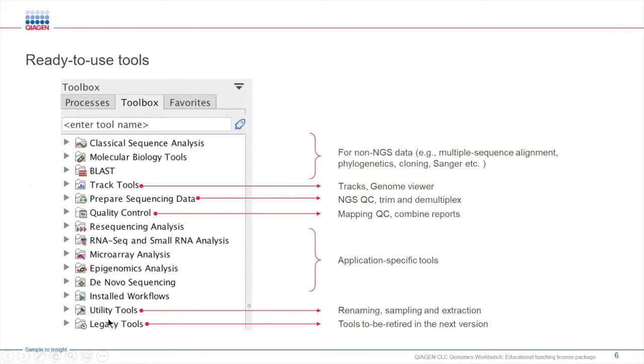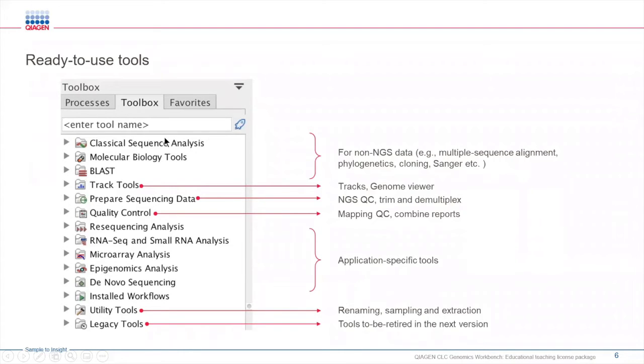In the bottom you will also see that we have a legacy folder in which you will find a wide variety of tools that are flagged to be retired for our next version. The Workbench is designed for those with non-informatics background and makes finding tools for specific applications really easy to do.